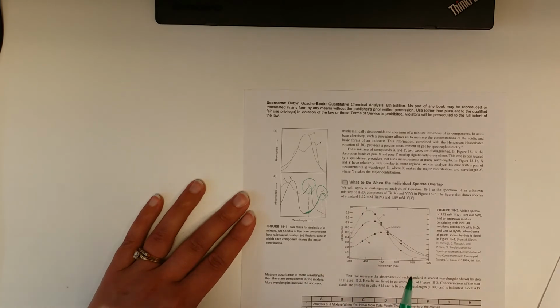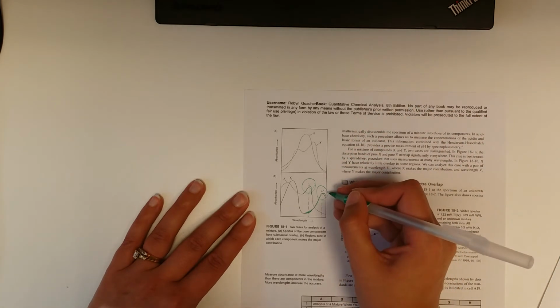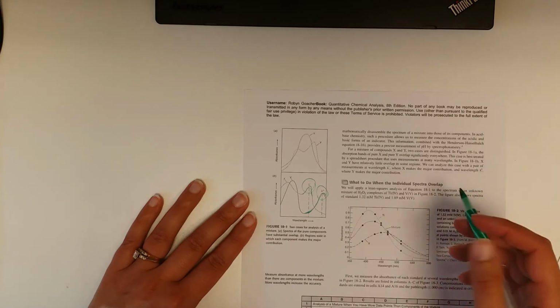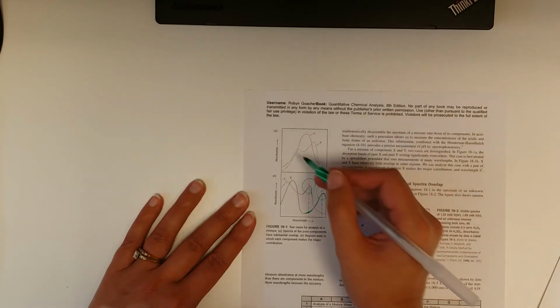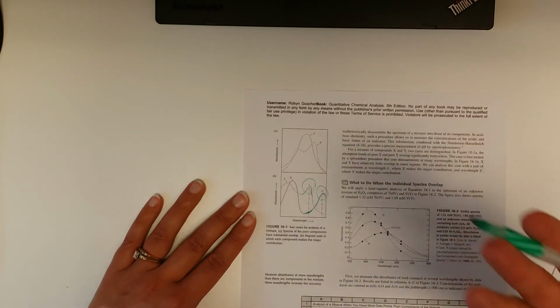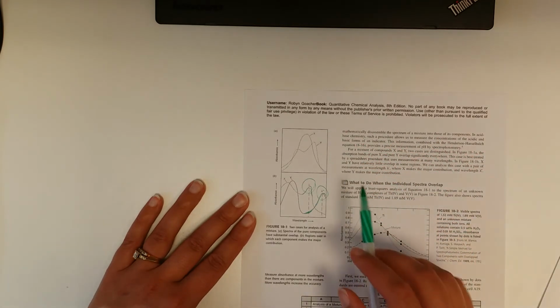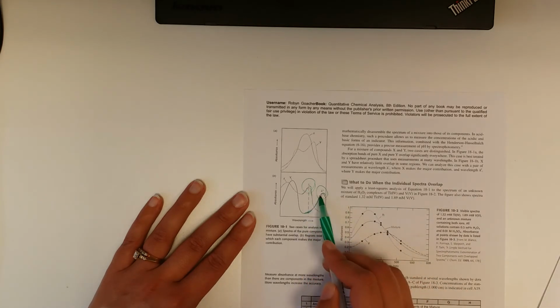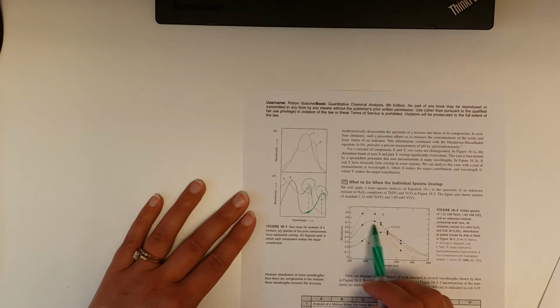That's when you do what I just talked about. Well resolved. If your spectra are not well resolved, and you've got this kind of a thing, where there is no one really unique thing, no one really unique wavelength, then what you'll do is you'll pick multiple wavelengths. Instead of 2, instead of this unique one and that unique one, you'll say, okay, 5 or more wavelengths.